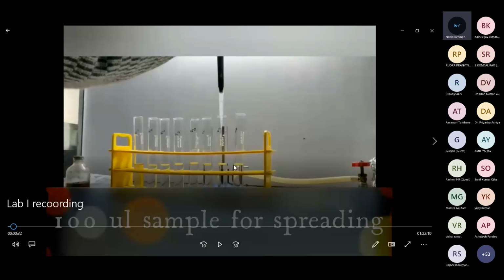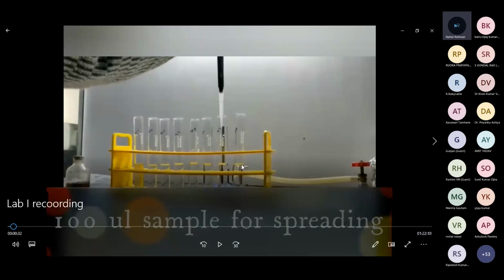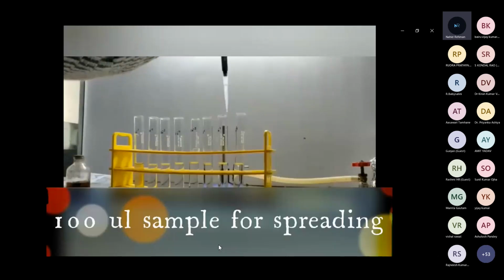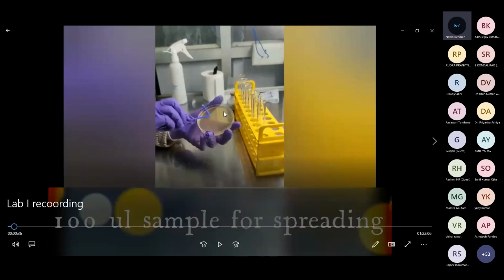So the third tube will be the 10 to the power minus 3 dilution, and the fourth will be the 10 to the power minus 4 dilution. Then the fifth tube will have 10 to the power minus 5, then minus 6, minus 7, minus 8. So you have to dilute it up to minus 8 or minus 10 dilutions, and then use this 10 to the power minus 8 tube, and then you have to do the spreading. You take 100 microliters of the culture and spread it over a Petri plate.